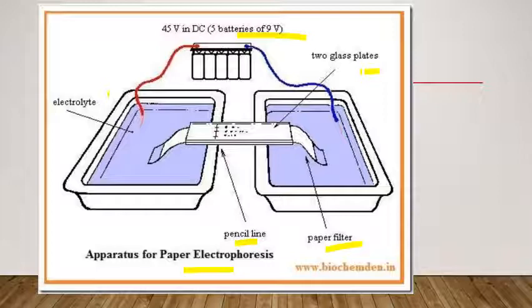And after the completion of the migration, we take out the paper, and then it is visualized.